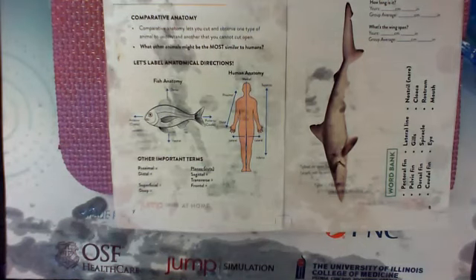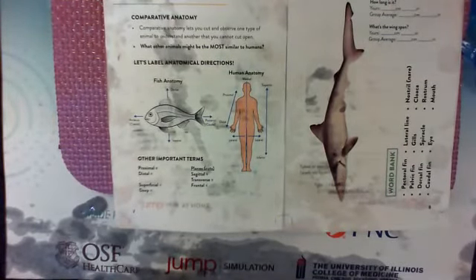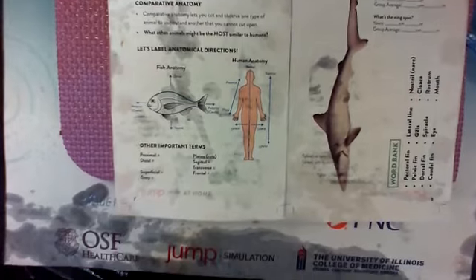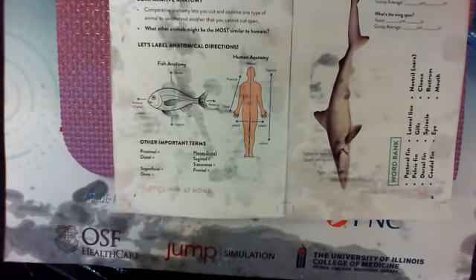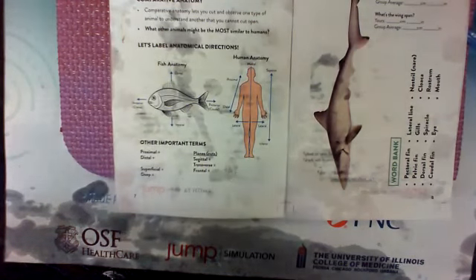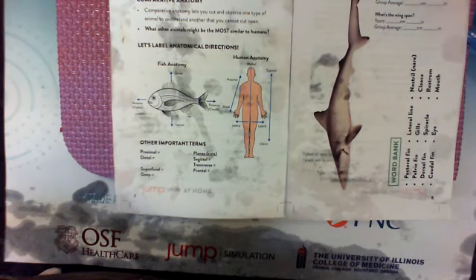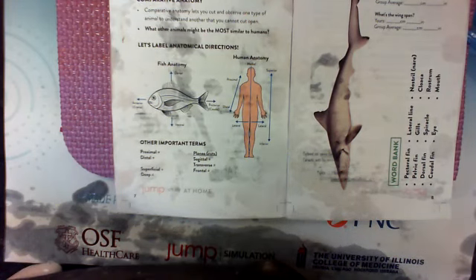So it's actually, by the way, I'm popping over to the chat. Formalin is the chemical, and formalin is not as toxic as formaldehyde, but it's a lot like an onion. How an onion makes your eyes tingle, same thing. Some of the chemicals get in and just irritate the mucous membranes that make your eyes a little runny sometimes or burn your nose. It's just saying, hey, don't drink this.